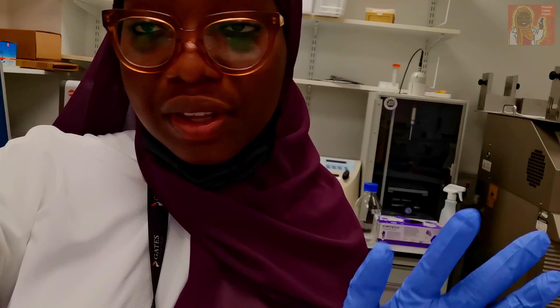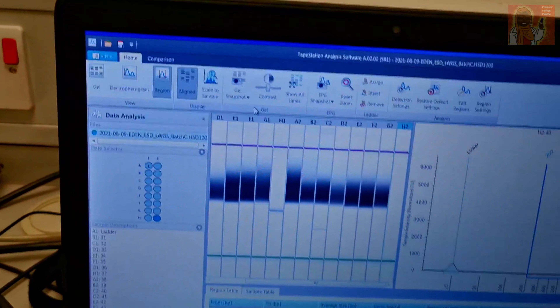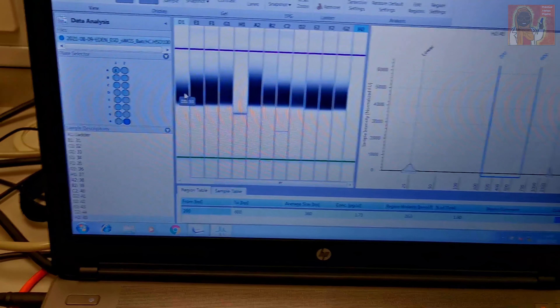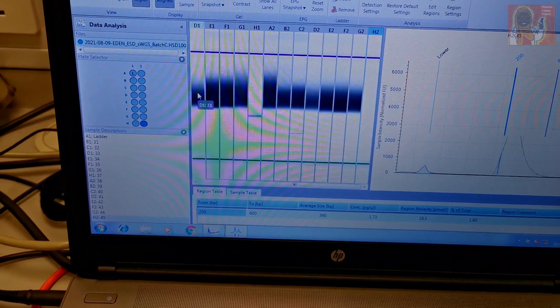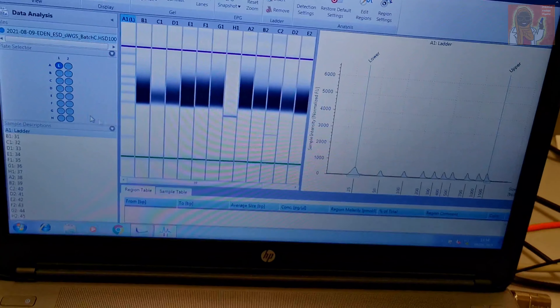Today's experiment data looks a bit better than yesterday's — the samples are a lot cleaner, even though I had a few problems with some samples. I'll show you guys how the data looks before exporting. This is how the data looks from the TapeStation instrument, and you can see that the gel images are a lot cleaner for today's samples in comparison to yesterday's.